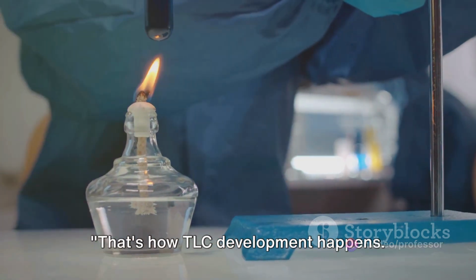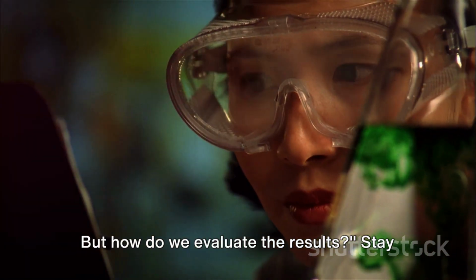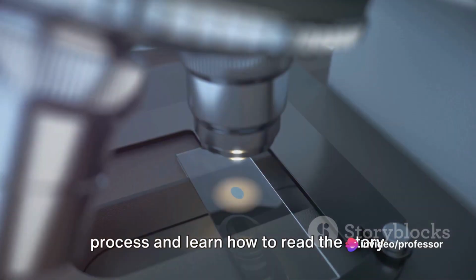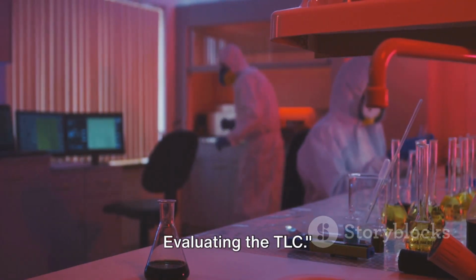That's how TLC development happens. But how do we evaluate the results? Stay tuned as we delve into the evaluation process and learn how to read the story that the spots on our TLC plate are telling us. The moment of truth, evaluating the TLC.